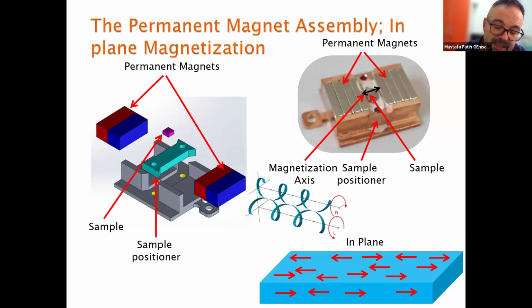The silicon drift detectors, the XRF detectors, don't like too much signal. So if there is too much signal from your sample, or if there is interference with others, it's also not good. But we can go maybe to the 1000 ppm level.